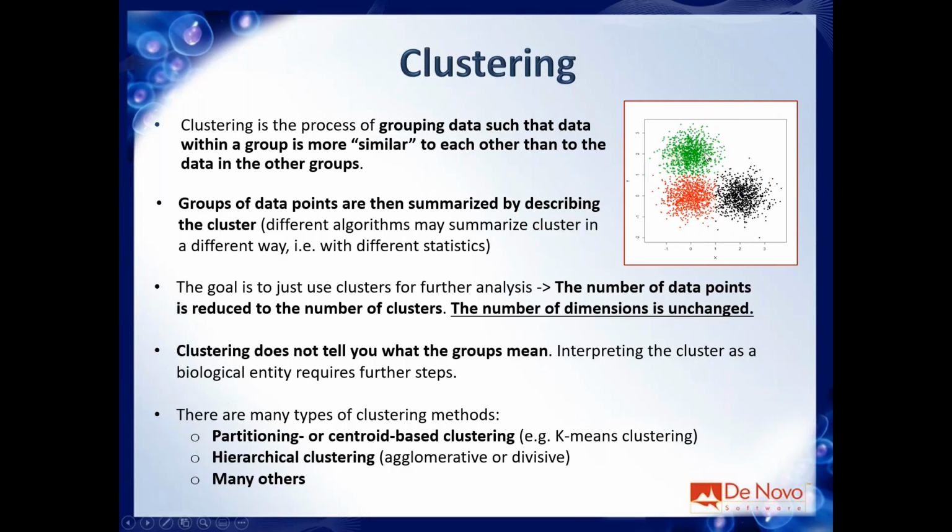It's very interesting to define the similarity. So how can you say that two events are similar? Well, mathematically speaking, usually the metric that you want to exploit is the distance. If you calculate the distance between 2 points, like in this example, and the distance is small, you can say that the two events are similar because they map in the same area, in the same region of the plot. If the distance is large, then it's very likely that those two events are not similar, so they are different, right?